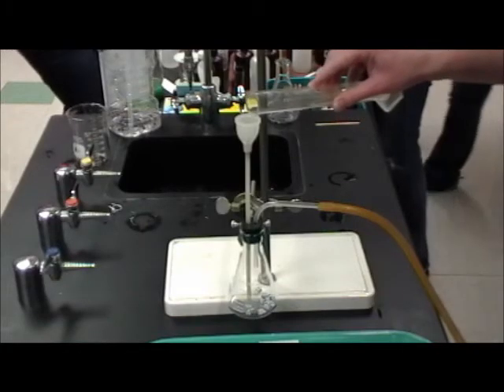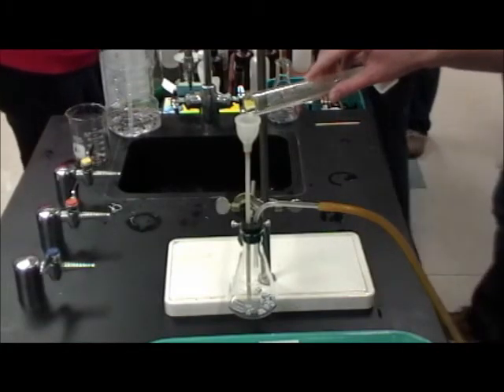With the stopper still in, turn it upside down and place it underneath the water level in the tank, and then carefully take the stopper out and leave the jar underneath the water level upside down. Slide the jar over to where the hydrogen gas is going to evolve, and now get your Erlenmeyer flask ready for the chemical reaction. The chemical reaction is going to be with some zinc pellets. Put that into the Erlenmeyer, then put on the rubber stopper and pour the hydrochloric acid in through the spout through the top.